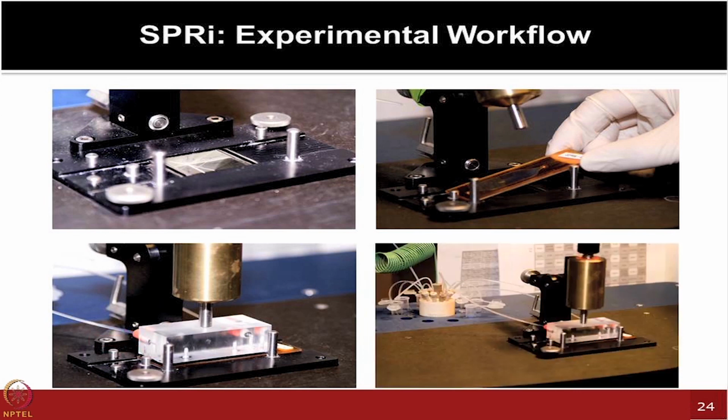And it probably reminds Josh of one of the old setups we have, the prototypes, where you can test 8 antibodies, for example, or 8 different proteins in a very new format, like you are developing a new instrument setup, and these kinds of solutions are coming in. You have the gold chip, everything is passing through those, and then going back into the washing containers.